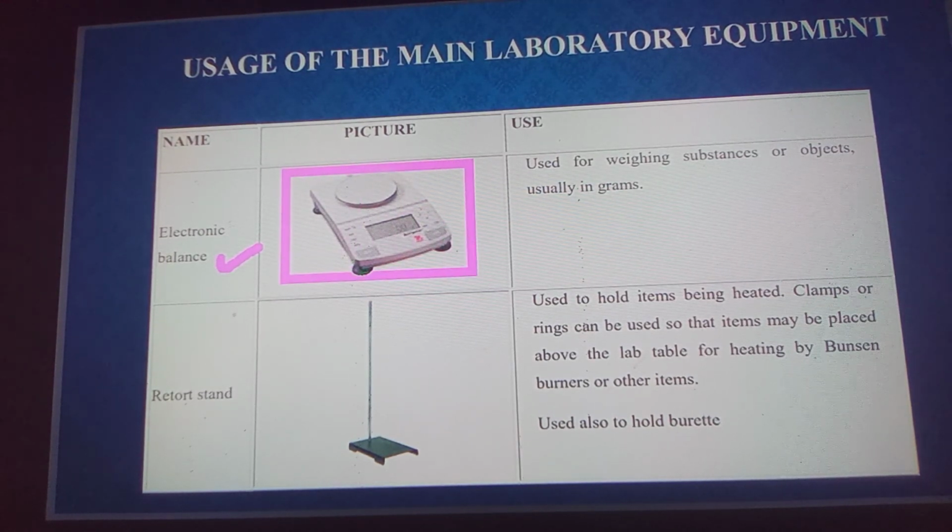Now you can observe the electronic balance, but I hope that some of you know this instrument. Its use is just to weigh the substance, usually in grams.